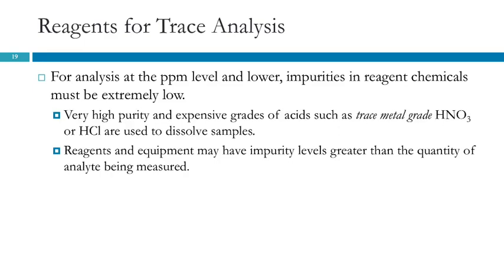And you can also have issues with contamination of your glassware, right? So if you're analyzing chloride at trace levels and you're using flasks that the Chem 1A students use to make their super concentrated sodium chloride solutions, you may have washed that flask many, many times, but it's possible that there's enough chloride residue on that flask that it's going to equal or exceed what you're trying to analyze, right? So for trace analysis, you have to be really, really careful.